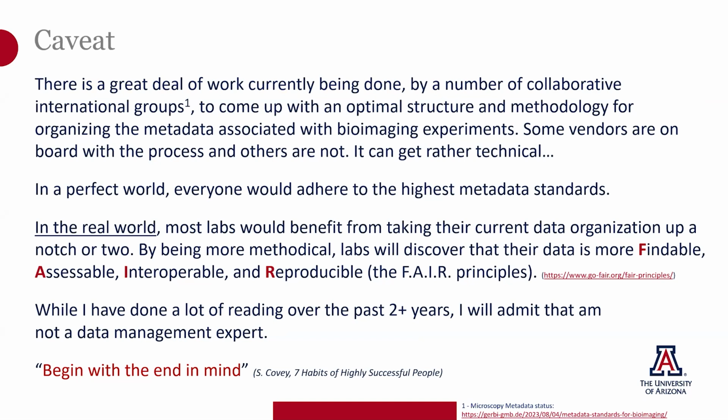In a perfect world, everyone would adhere to the highest metadata standards. But in the real world, in my experience, most labs could benefit from at least taking their current data organization up a notch or two. By being more methodical, labs will discover that their data is more findable, accessible, interoperable, and reproducible. These are the FAIR principles.